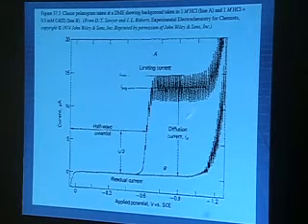And again, this is an old study. So the jiggling is not as big as it would be if you use modern electronics to capture the whole Ilkovic transient there. But it gets hard. Where do you draw your line now? If you want the diffusion current, they've drawn a line right down the middle here where the ink is a little thicker. And that's how you do it. And where do you draw that?